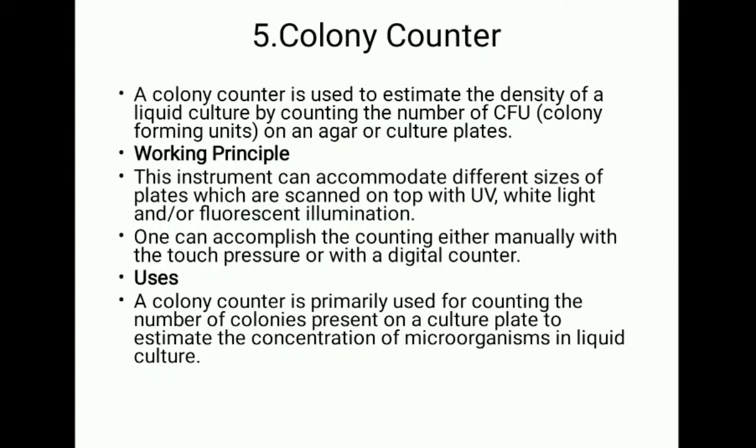Next we have colony counter. A colony counter is used to estimate the density of a liquid culture by counting the number of CFU, that is colony forming units, on an agar or culture plate. Talking about principle, this instrument can accommodate different sizes of plates which are scanned on the top with UV, white light or fluorescent illumination. One can accomplish the counting either manually with a pen with a touch pressure or with a digital counter.